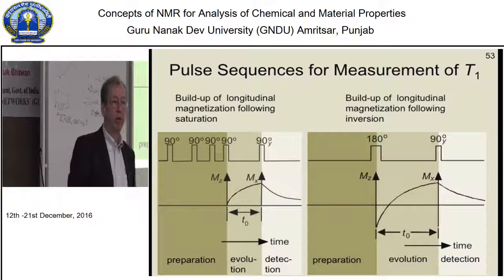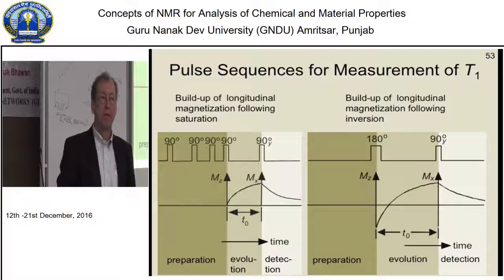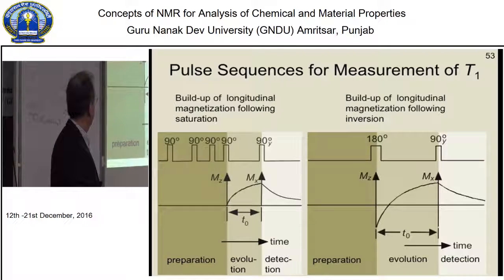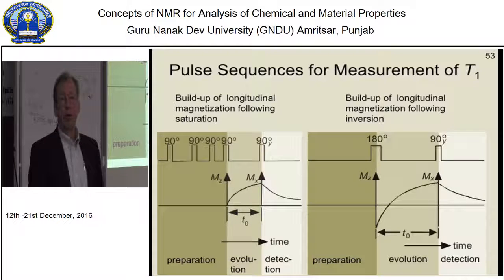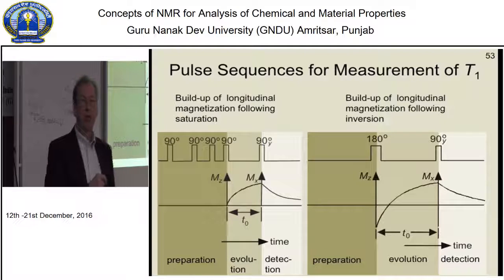It requires several measurements. It's actually the original idea behind two-dimensional NMR spectroscopy. People hadn't thought about it that way, and now people have recognized that it's a two-dimensional experiment. You measure T1 in this time, and you measure the signal decay. So your signal build-up is T1, signal decay is T2. You measure a T1, T2 correlation experiment. And you will see that's very important in geophysics. You can learn a lot of physics from that type of experiment by reading it as a two-dimensional experiment.